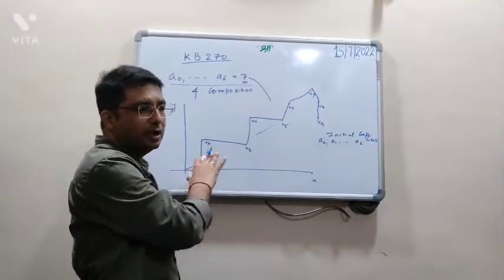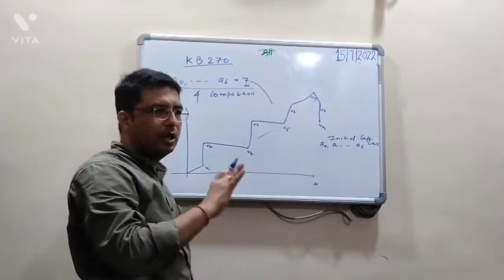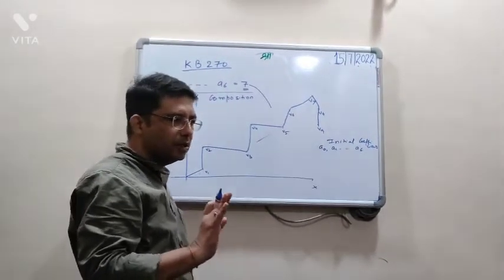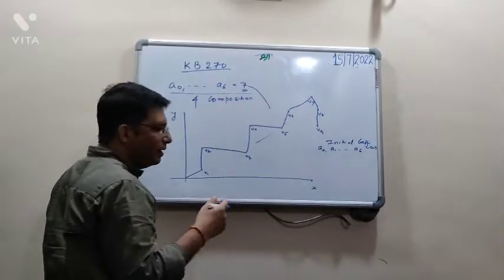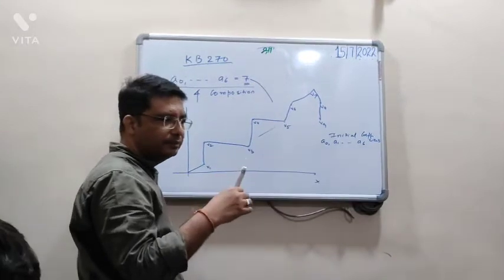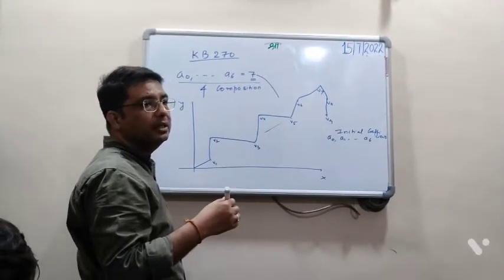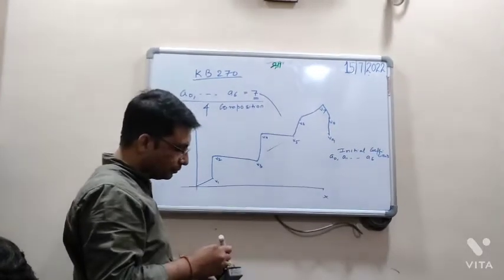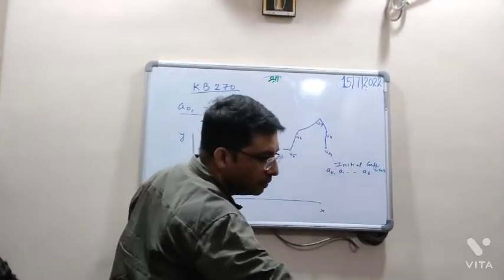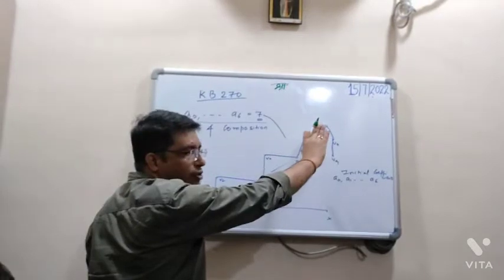These are actual values. What is our objective? Standard value. You have to tell the machine that now you have to fix the standard value. So I'll represent the standard value as a cross, right? Do we have another color pen? This, I'll say, is the actual value.